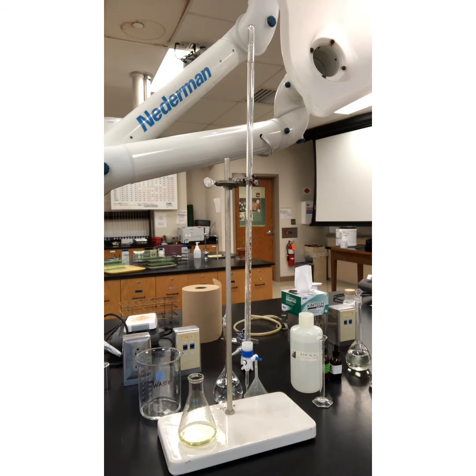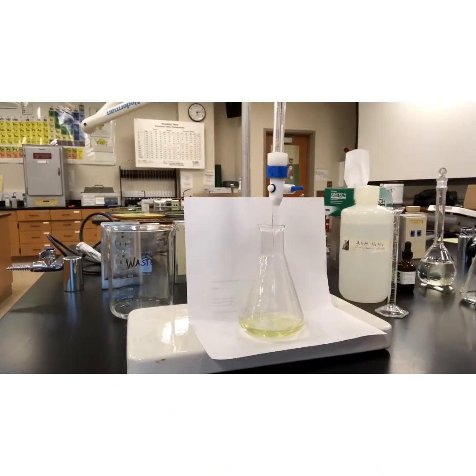I'm going to put a white piece of paper behind my solution. It can help that color change be a little bit more obvious, especially possibly on camera. All right, I'm going to go ahead and zoom in and put my white paper up. Okay, so I've focused the camera in on the solution. You can't take reading measurements on the burette anyway. There's no way I can make you see that on the camera. So let's focus on that color change.